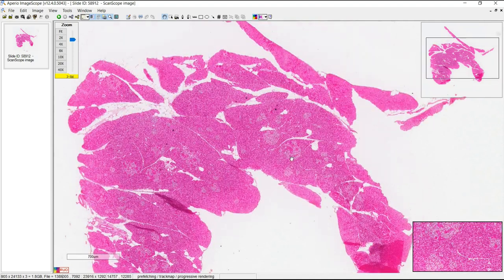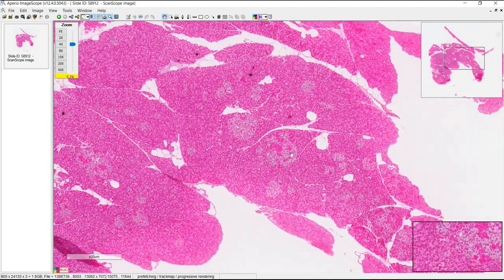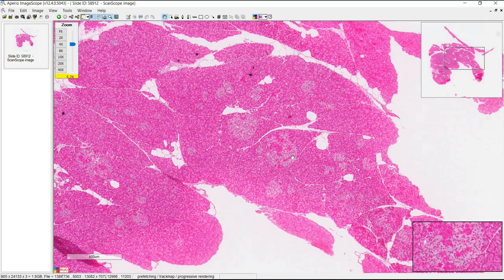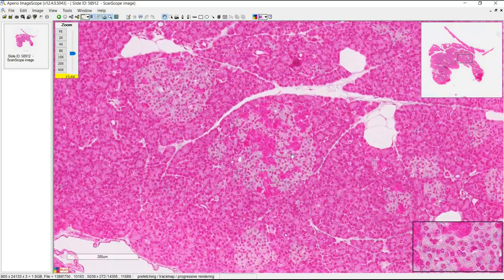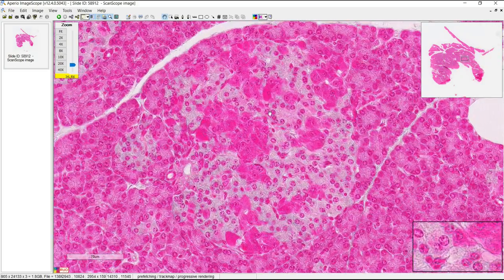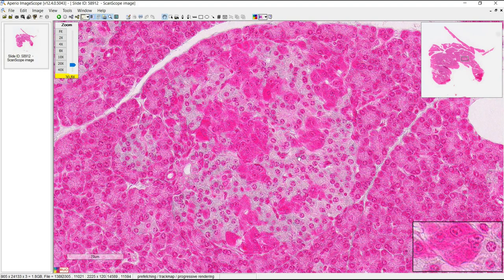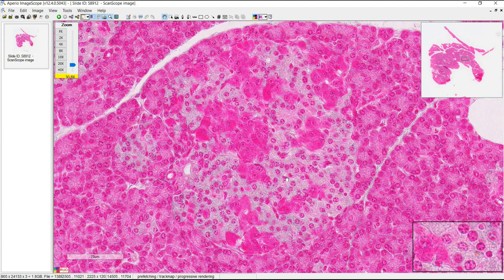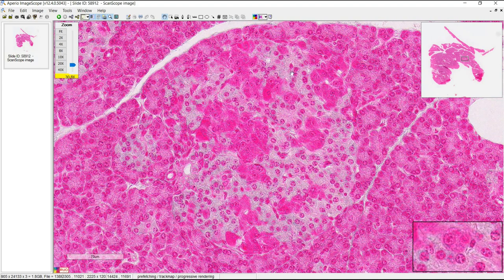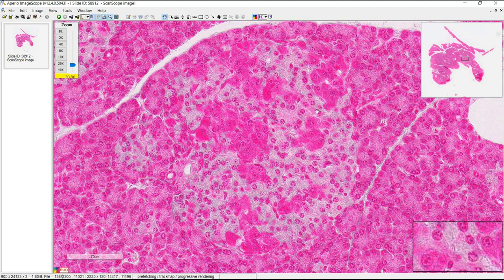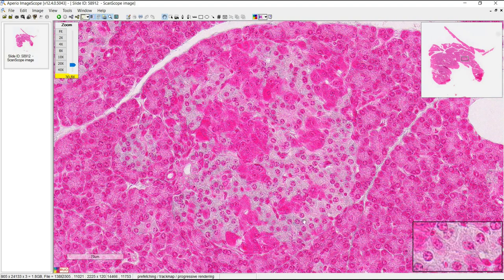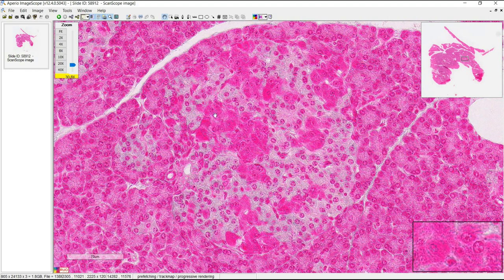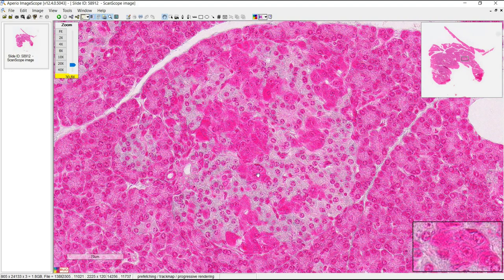This is the final slide for the pancreas. We see the islets again here. This slide uses special staining to show the different kinds of cells in the islets. The majority are beta cells that secrete insulin — those are the lighter staining ones. And these are the alpha cells that are glucagon-secreting.